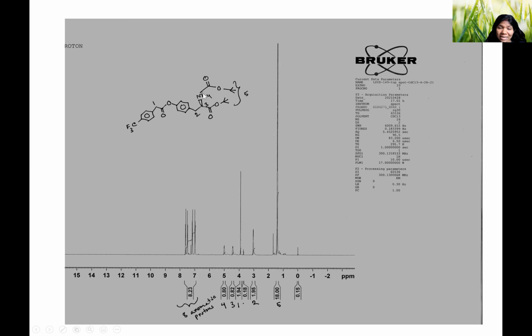And 4, as I had mentioned before, that this proton you may or may not see. Okay, so here I have used the solvent CDCl3. So as I said, in methanol D, you will not see it, but because this is CDCl3, we will see this proton. So this is at 5. It has chemical shift value of 5.